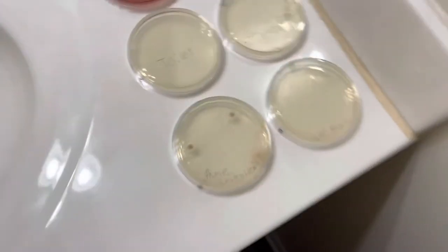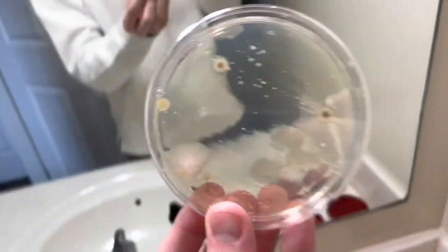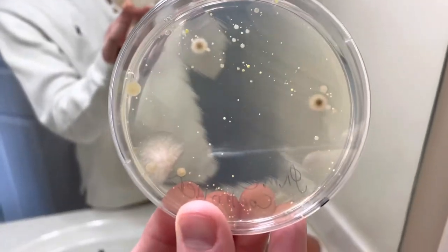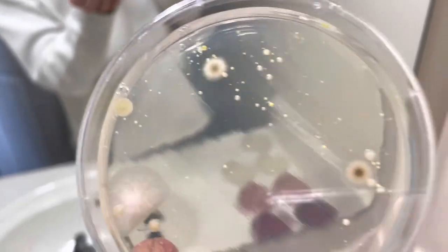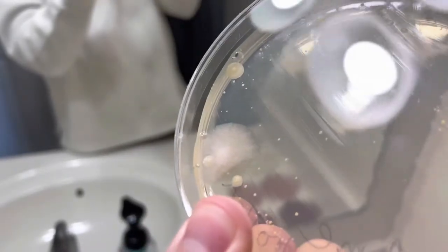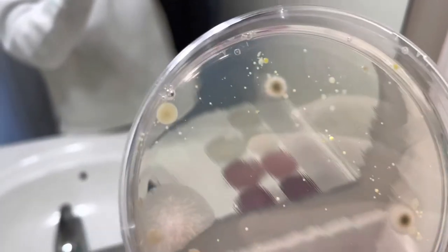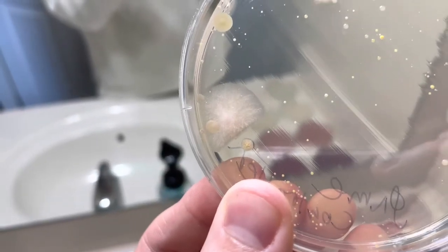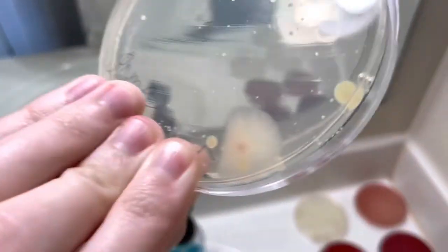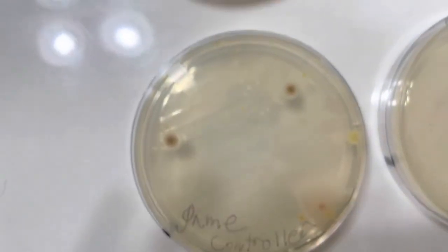Oh my goodness, you can so tell. There is a little fungi-looking thing — you can tell from the kind of hairy texture to it — and there are so many different kinds of bacteria. There's a big group there, a ton of them down there. Yeah, that is crazy. There are a couple inside of that container. Wow. Anyways, holy cow, that's only the game controller.